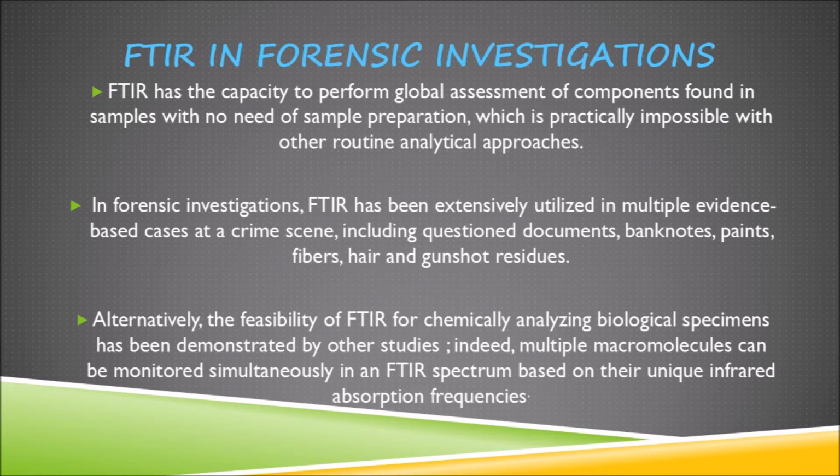Okay, so next, FTIR is also being used in forensic investigations. First, FTIR has the capacity to perform global assessment of components found in samples with no need of sample preparation, which is practically impossible with other routine analytical approaches. In forensic investigations, FTIR has been extensively utilized in multiple evidence-based cases at a crime scene, including questioned documents, banknotes, paints, fibers, hair, and gunshot residues.